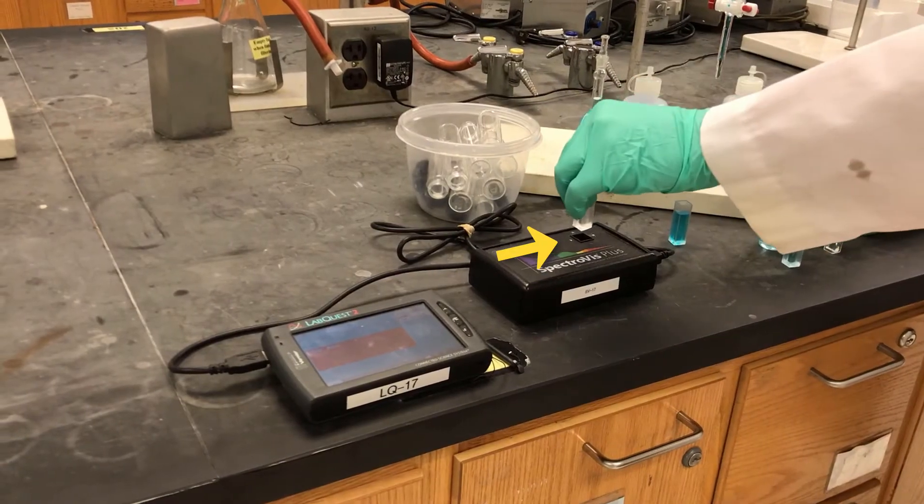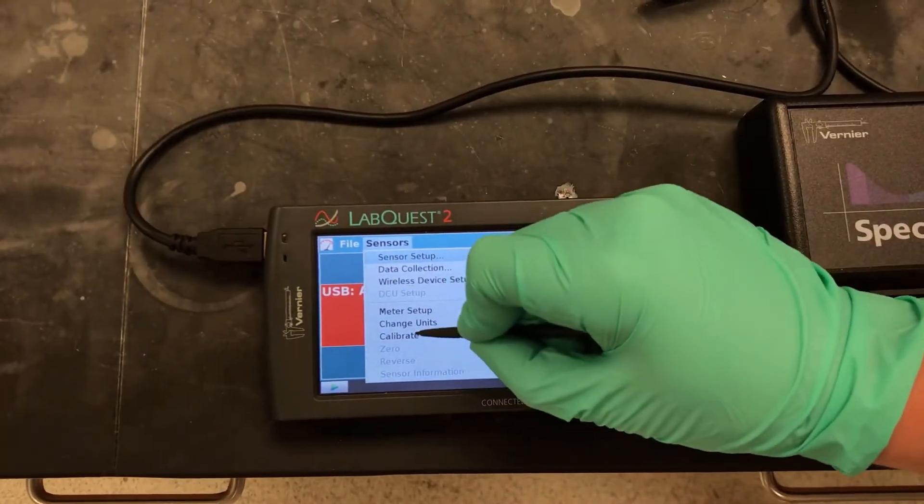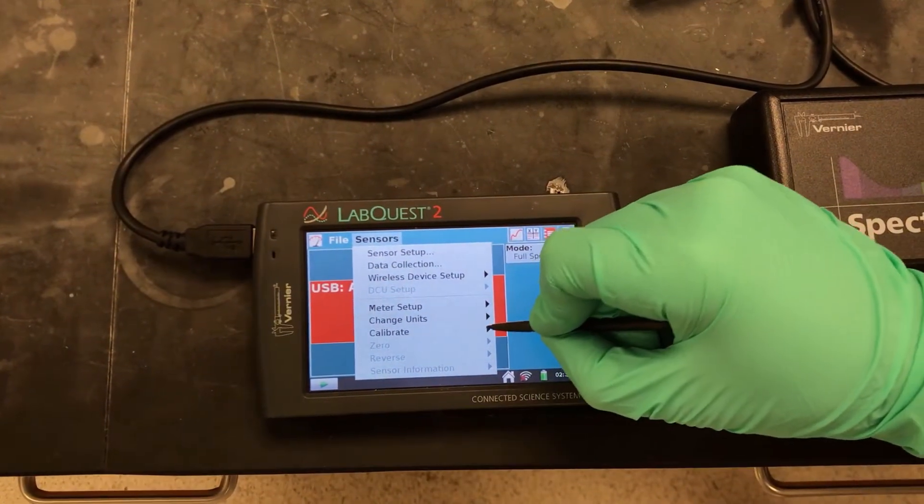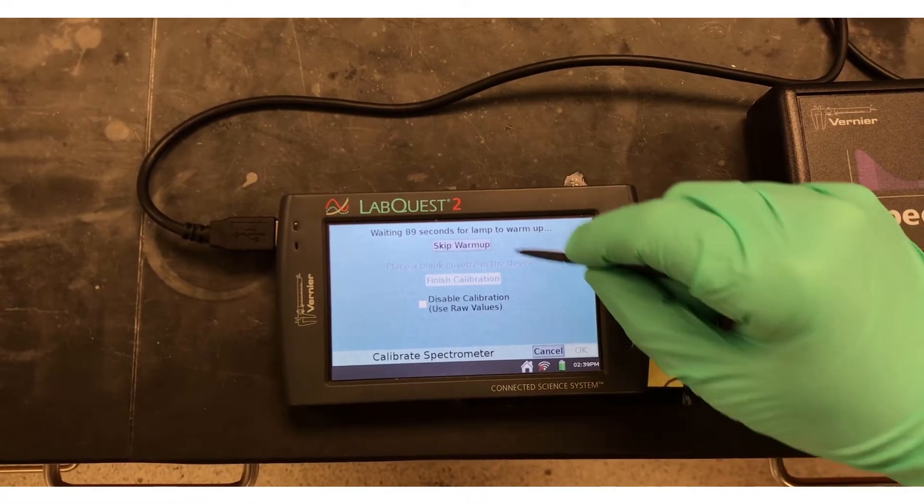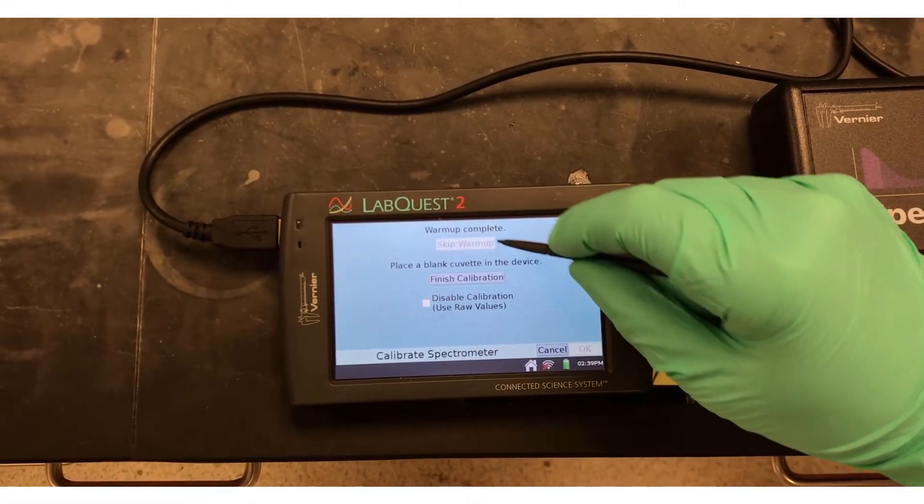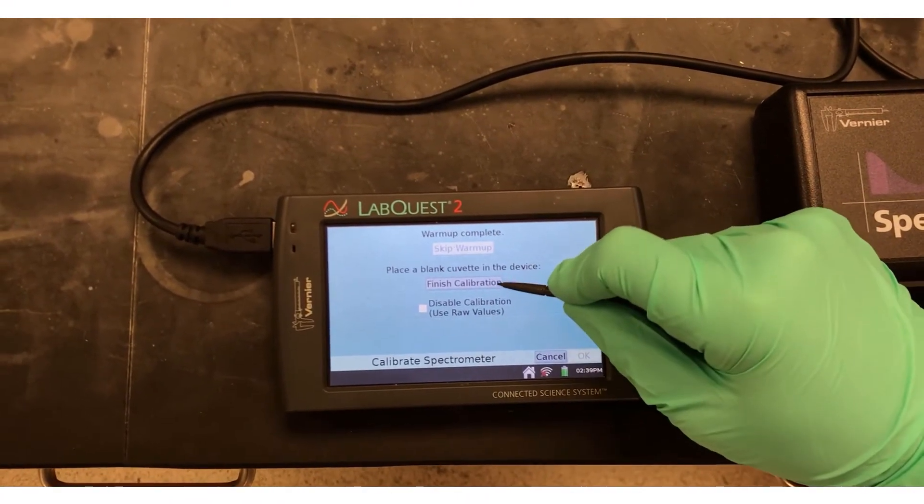To calibrate the instrument, insert a blank, which is a clean cuvette filled with deionized water. Tap sensors, then calibrate. Calibrate the spectrophotometer. Tap OK, and if the SpectroVis has already been in use, you may skip the warmup. Once warmup is completed, click Finish Calibration.